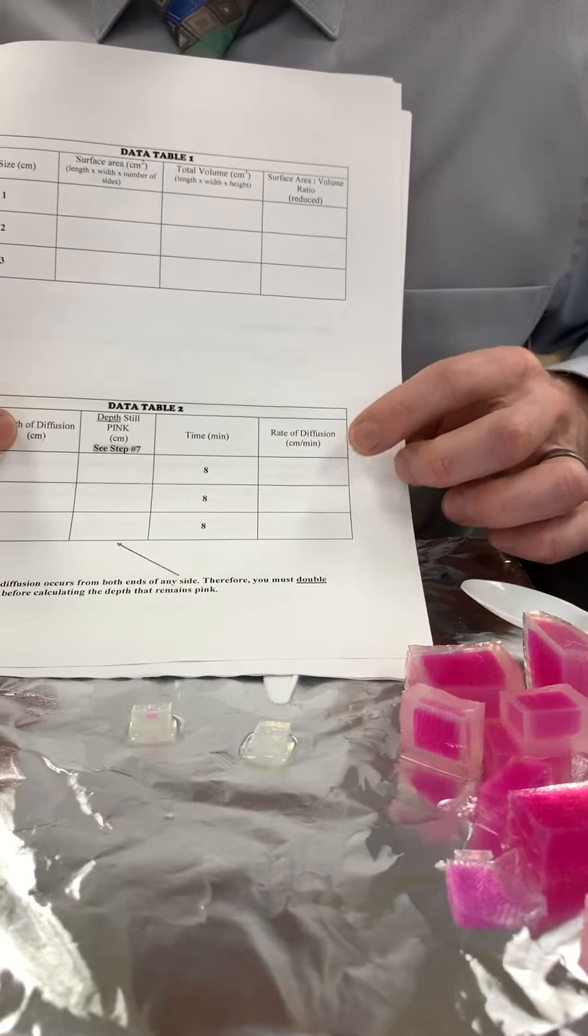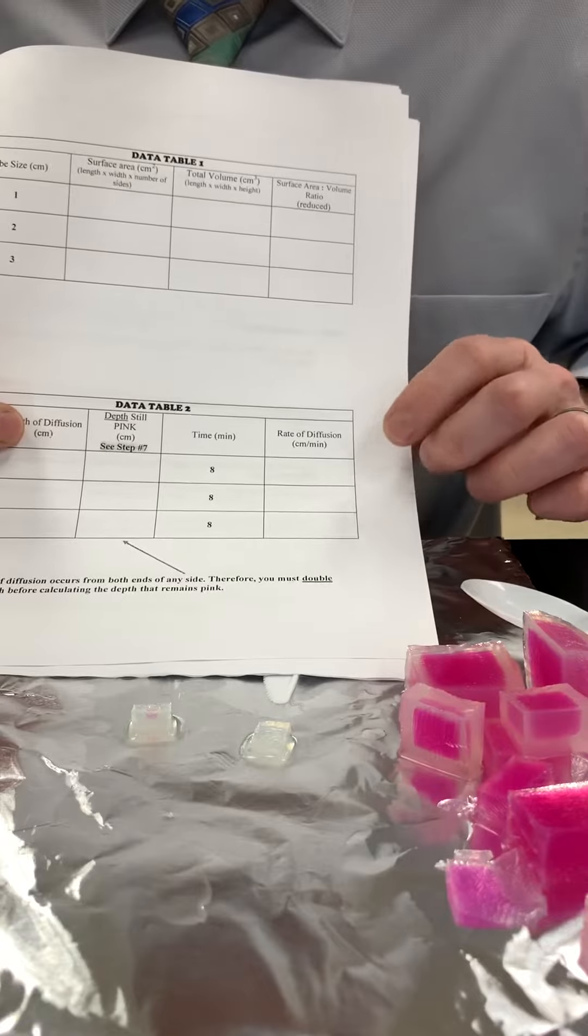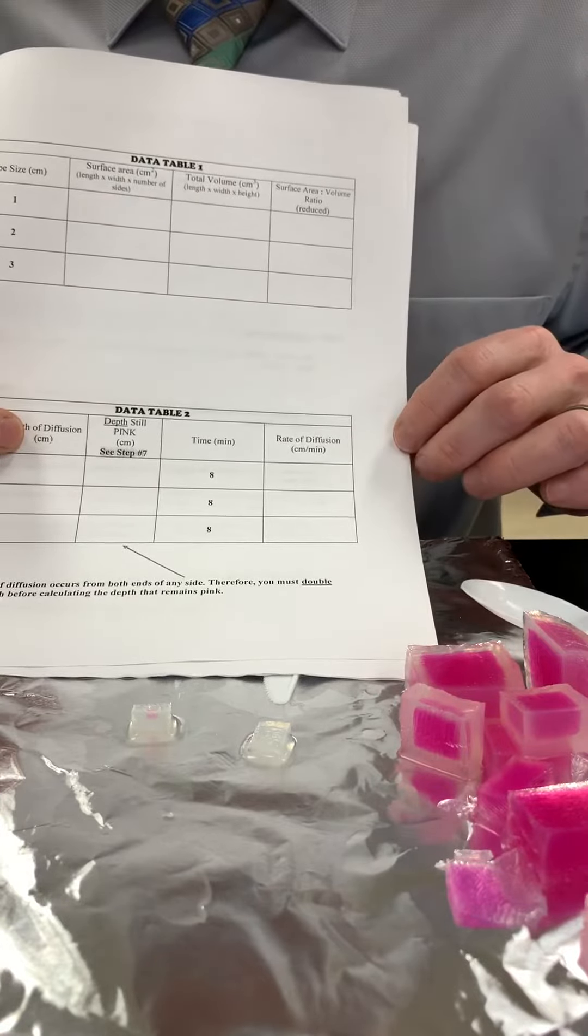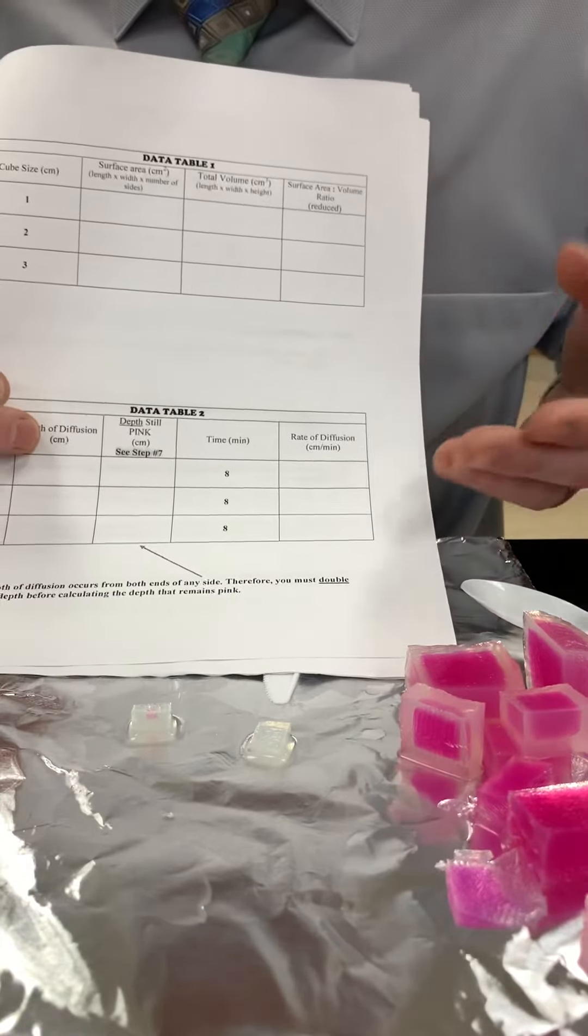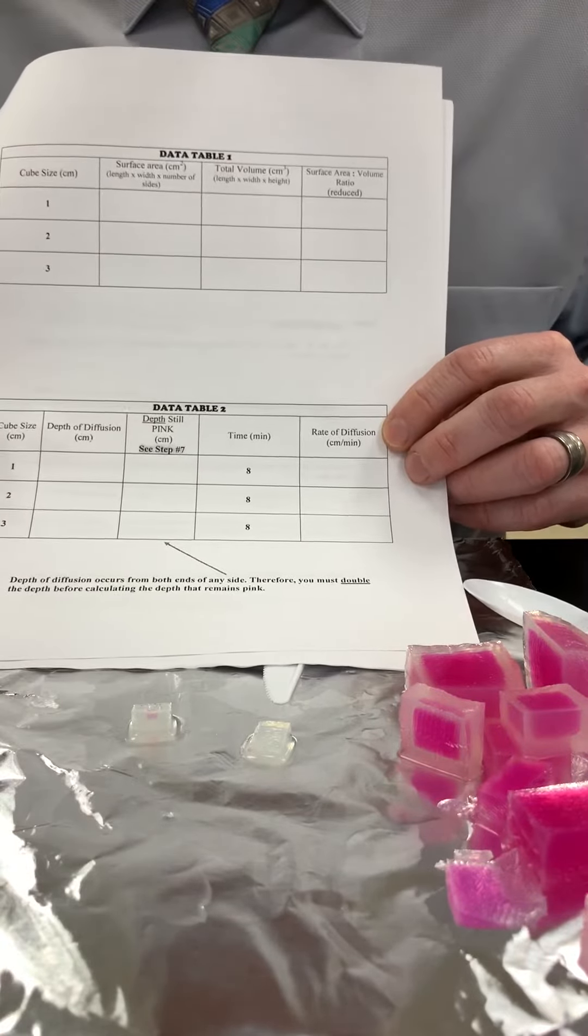Otherwise, we wouldn't be able to compare different size cubes if the rate of diffusion was different in each of them. So essentially, that's what you do in the lab, and from there it's collecting the data and answering the post-lab questions.